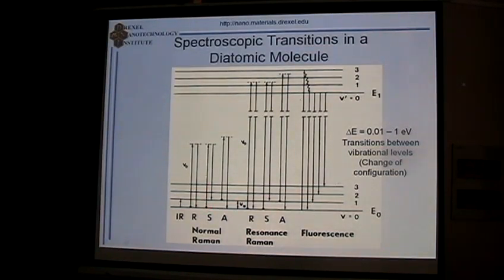However, it can go from a ground state to a higher vibrational level. Basically, in this case, absorbing some energy and emitting a photon with a different wavelength. And this is exactly what is called Stokes scattering. Of course, you may have molecules which are already at higher vibrational states. So what will happen? They will go to a higher level and then return to the ground state.